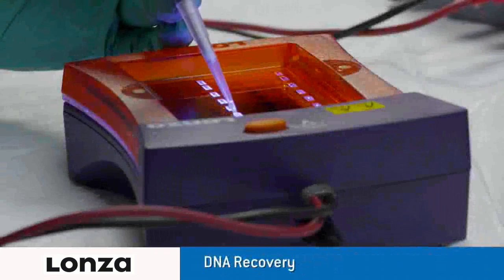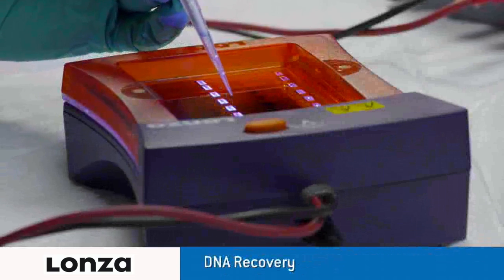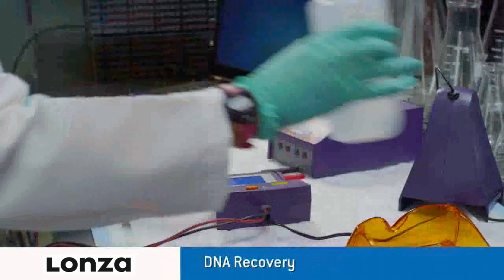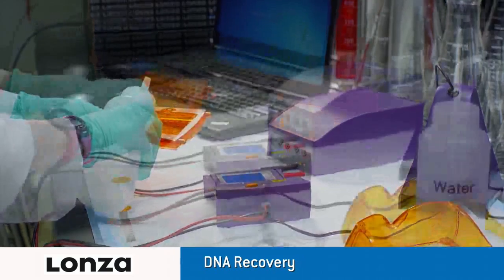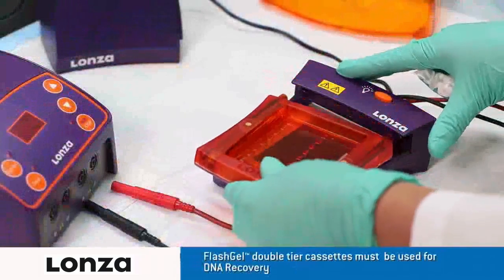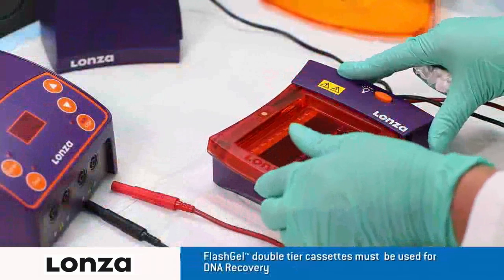With the FlashGel system, you can recover DNA samples with a simple extraction — no more need for band excision, purification steps, or UV light. Wet the wells with deionized water. Blot dry any excess water with a lint-free tissue. Load the cassette onto the dock and snap into place.